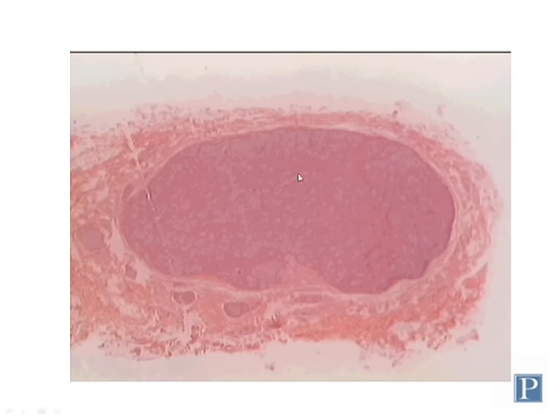Sympathetic ganglia at low magnification you can distinguish from dorsal root ganglia because although they have a connective tissue capsule as well, it's much thinner, which is this dark structure towards the outside. And I'm not talking about this stuff. This is other connective tissue that has been excised along with this ganglion when it was dissected out.